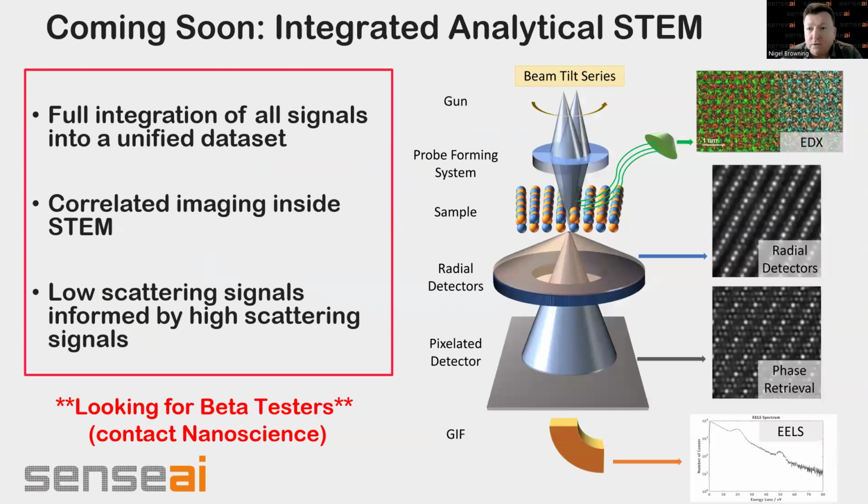Now, I should say that this is not the limit of what we're trying to do with Sensei. 4D STEM is great, and there are lots of things you can do with that. But as in most cases, you'd like to have analytical capabilities that go with it. So we're now integrating EDX. We're also integrating EELS. Simultaneously, with the subsampled data sets, because we're only acquiring a small fraction of the pixels, we'll have correlated 4D STEM, EDX, and EELS.